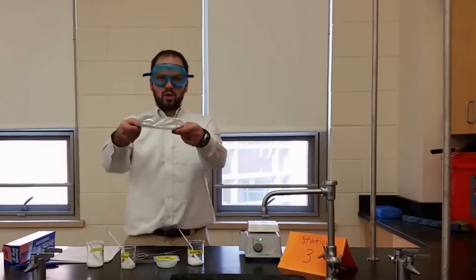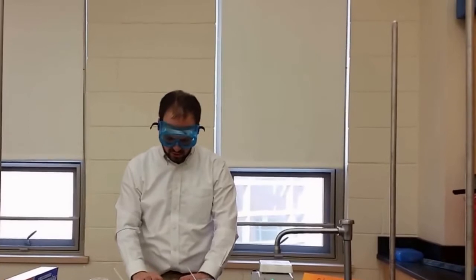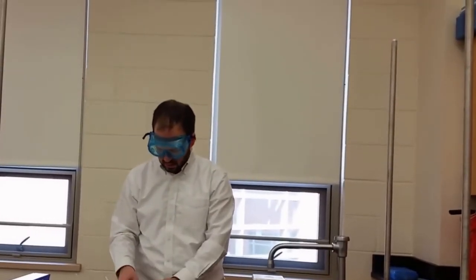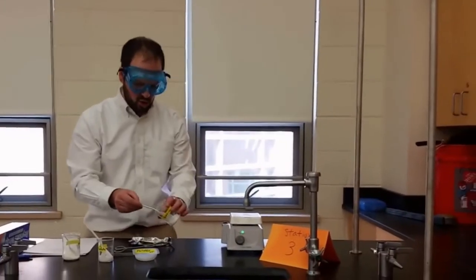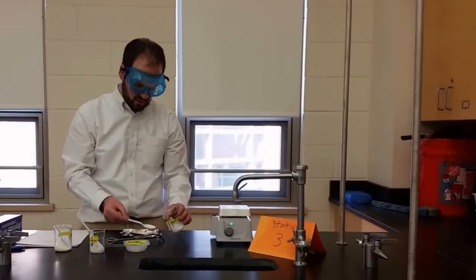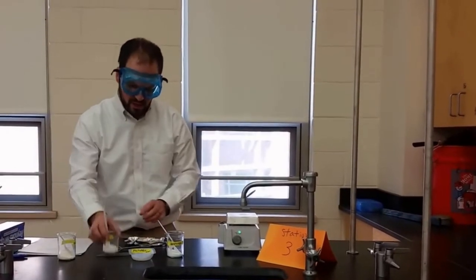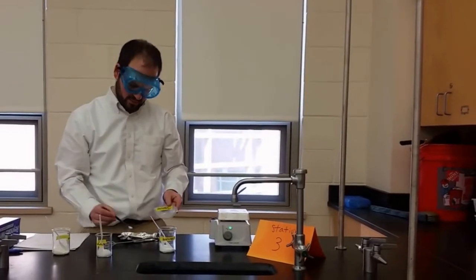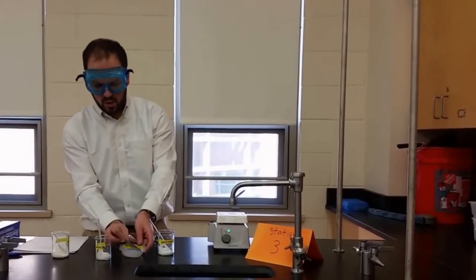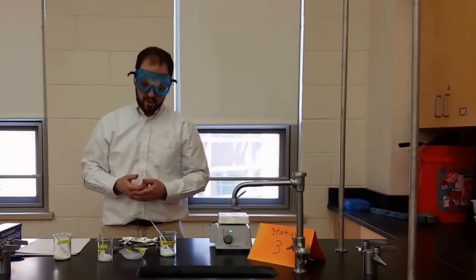We're going to turn our aluminum foil into a boat, but it's actually going to be kind of like a tray. So we're just going to fold up the sides to make the edge of the tray, and then we're going to make sure the bottom's flat and put very small amounts of chemicals. I'm talking very small amounts, less than the size of a pea, onto each of the corners. So chemical, and paraffin is going to go into one of them. You can use the forceps or your hands to get in the last one. All right, you're going to want to write down the locations of each instead of relying on your memory.